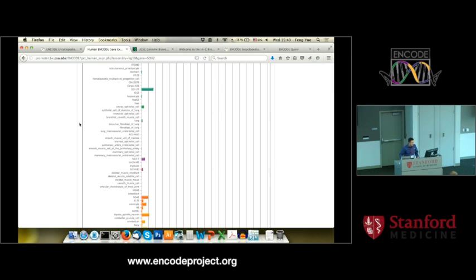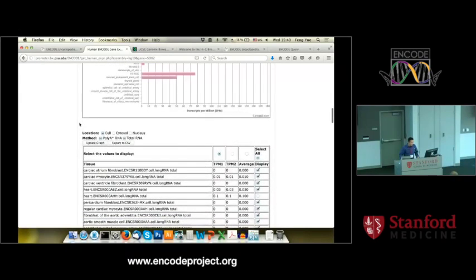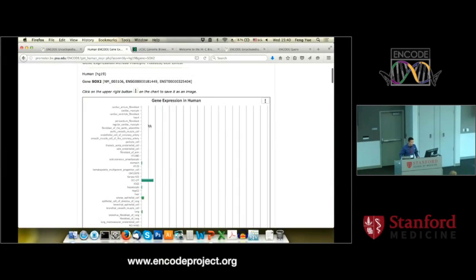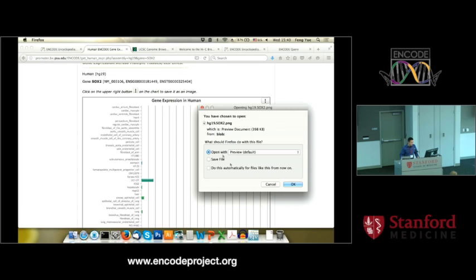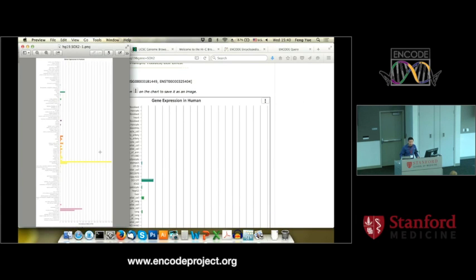For this picture, you can download it and directly use it for your publications — you can click here to save a JPEG or PNG. But if you use it for your publication, there might be too many bars. You really don't need that many bars, right? That's why my student devised a very smart function. If you go further down, you can choose what tissue you want to display in the query.